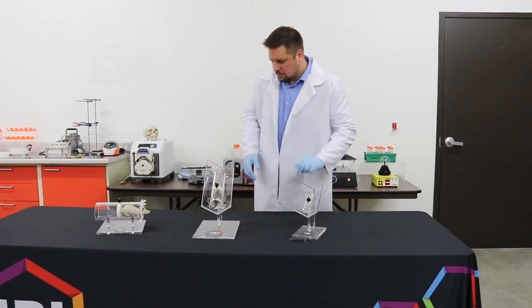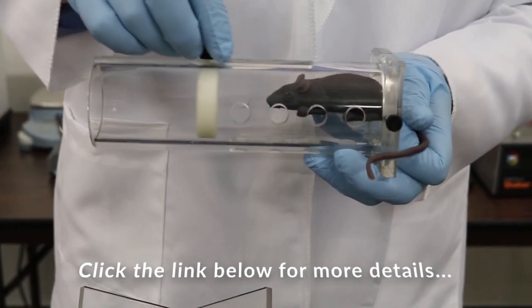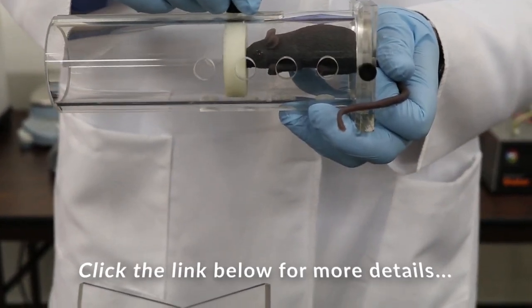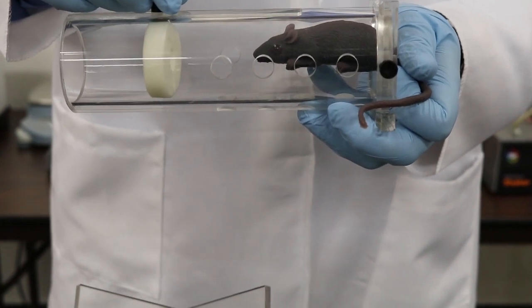By drawing the tail into the holder through the appropriate machined slot, the nose piece can then be easily inserted and tightened to secure the animal.